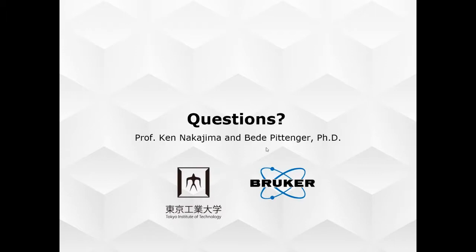Yeah, I see there are several questions that are mainly for Ken. Ken, you had this really interesting result where you showed the heterogeneity, and the Tg, for instance, varied with location. You showed these two images that had different levels of contrast, even though they were at a similar reduced frequency. There are several questions on that here. One, what is the length scale of these microphases you see? Two, what do you think is the physical origin of the variation? And three, can you say anything about how this helps optimize the material?